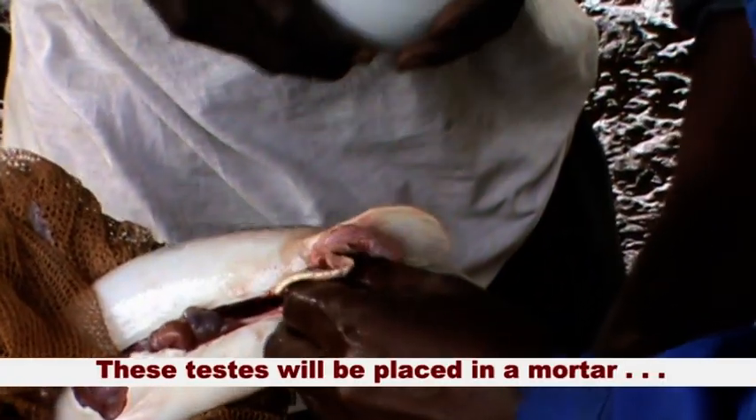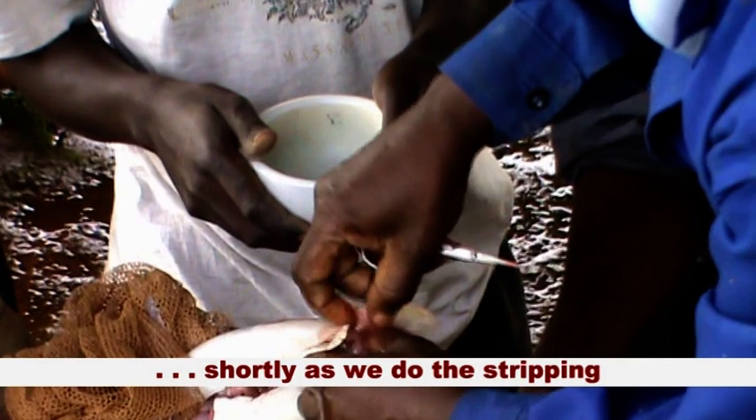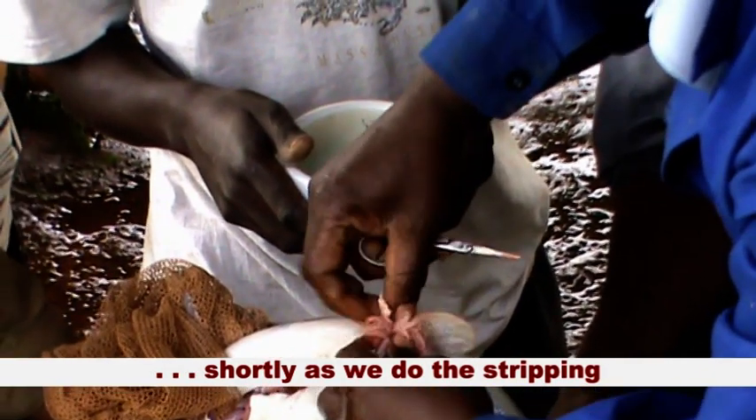These testes will be placed in a mortar shortly as we do the stripping.